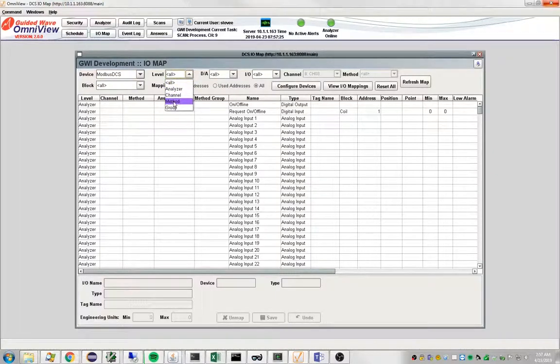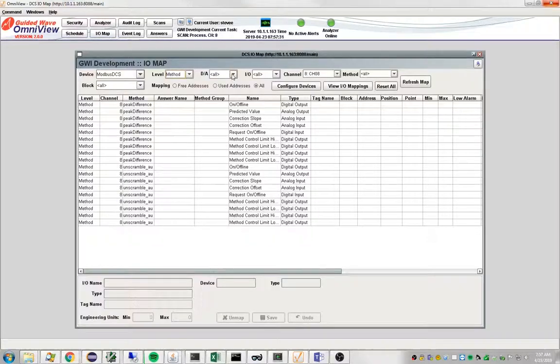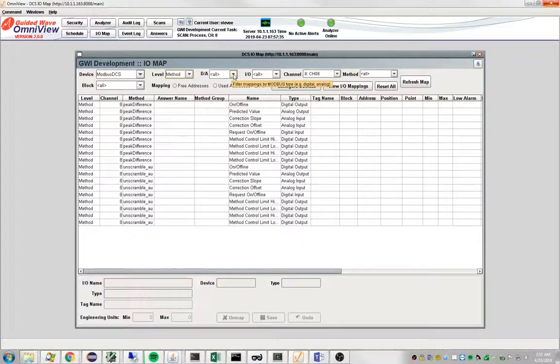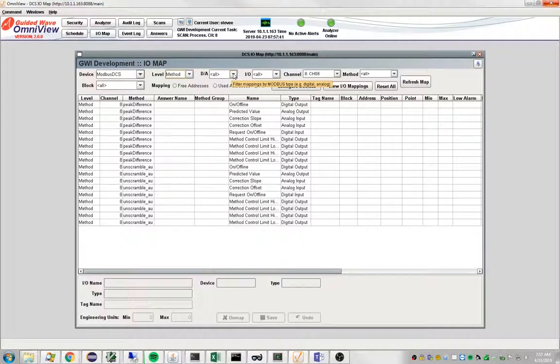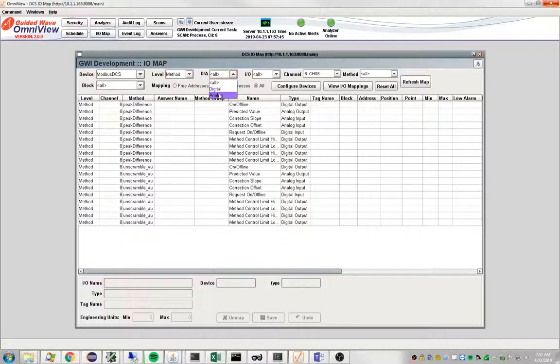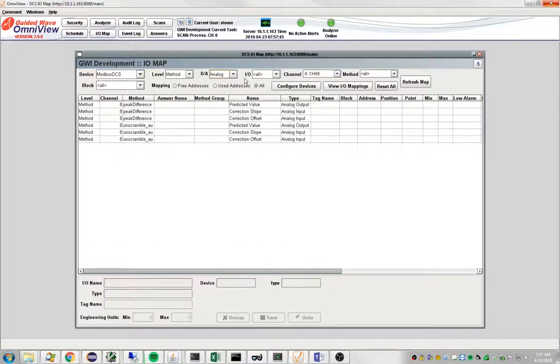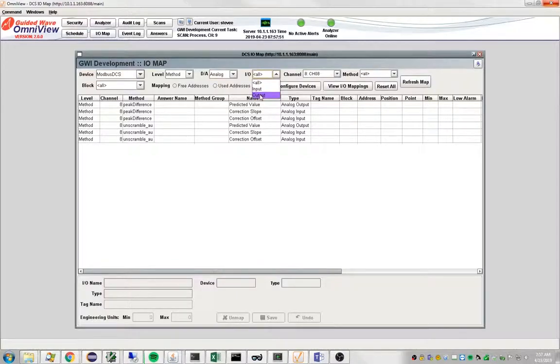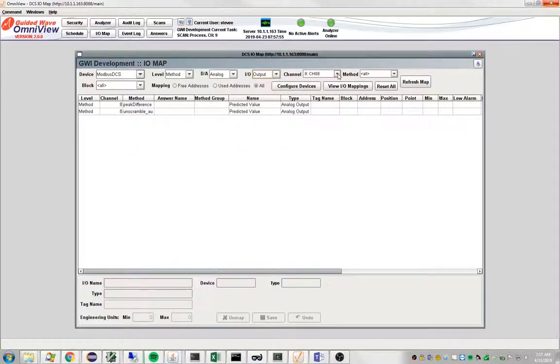So we're going to select this filter and what we're interested in is getting the value, the number being produced by this method out. So that would be a floating point number which is written as an analog value and it is an output.